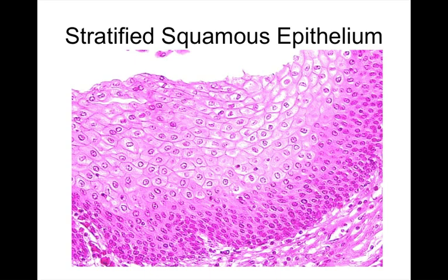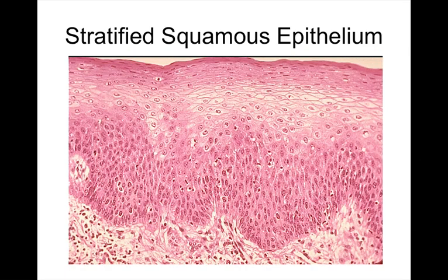This is probably the esophagus. Another view of it here. Similar here, we do have a little bit more of the top. We see it flattens out again. It does pick up the stain. They get a little bit thinner, but again, this isn't going to be skin, I don't think.